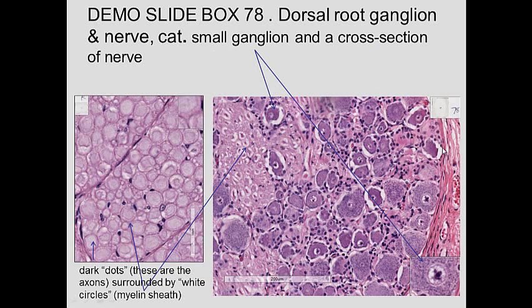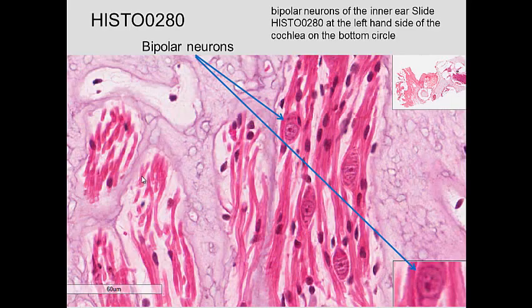We can see the ganglion cells and the Nissl substance. We can see a fibrous capsule around it — these would be fibroblasts in there. These are myelinated axons; you can see where the myelin sheath has been removed with the axon in the middle. Over here the axon is quite big, and you can see the myelin sheath around it and the Schwann cell nuclei surrounding it too. If you look right in this region you can see bipolar neurons, which are ones that have a pole on either side of the nucleus. That's what we see in this slide — in the ear.